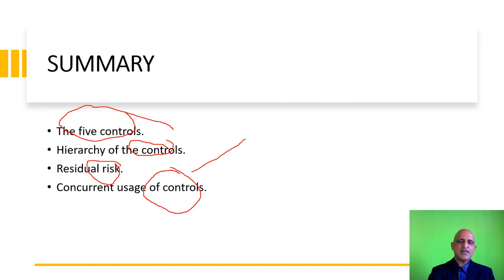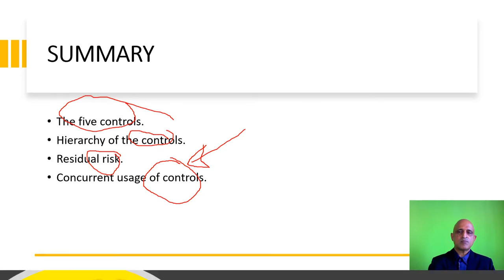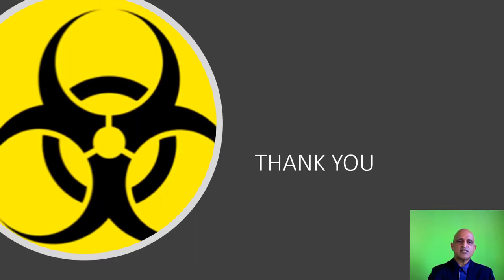This brings us to the end of this introductory module on risk mitigation. We have learned about the five controls, the hierarchy of controls, the concept of residual risk, and the concurrent usage of controls. I will delve into each of these controls in a series of lectures during this current week. Thank you very much for your participation, and I wish you a pleasant learning experience. Thank you, and stay biosafe.